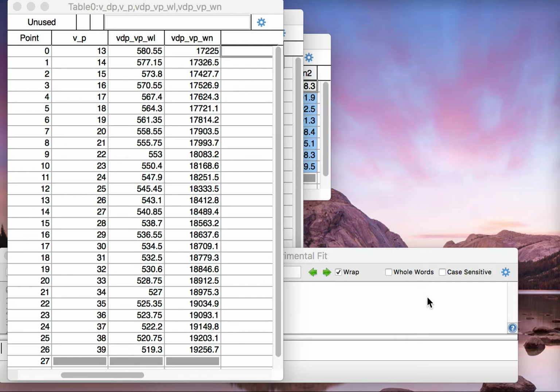So what we're going to do is take all the data and fit it at once, all the data meaning the data from multiple different ground states to multiple different excited states in the electronic level, and fit that. Thanks to a student, Greg Peters, for data from his lab analysis. I'll use his data as an example here.